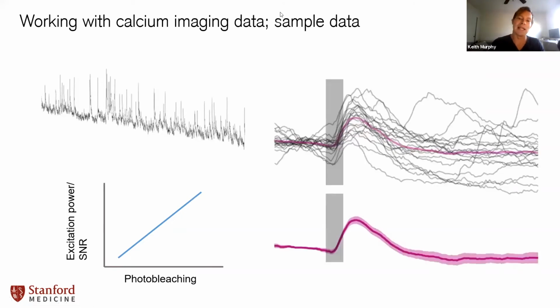Something to think about. And Kim already mentioned one method that we could use, which is to deliver ultrasound to this system. And over many, many events, you can ask, do these statistically seem to respond at the same time across trials? Because again, these neurons may just randomly do things independent of ultrasound. So this is how we would do that. And here I've delivered 20 different trials, and you can see that reliably the neurons respond to ultrasound. And here's an average plotted with standard error of the mean here.